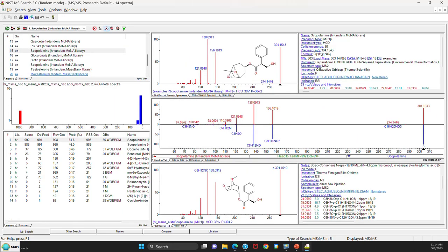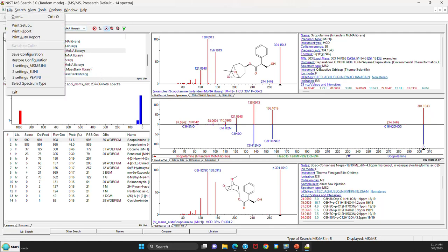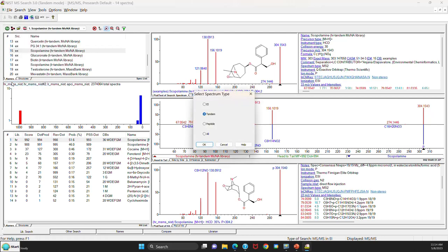I've now opened the version 3.0 software. And the first thing you'll note is when you go to file, you'll see this new option called select spectrum type. This allows you to pick the type of analysis you want to do, whether it be tandem or EI. But you can still open all of the options if you want to. But if you use EI or tandem, it will greatly simplify the library search options window.